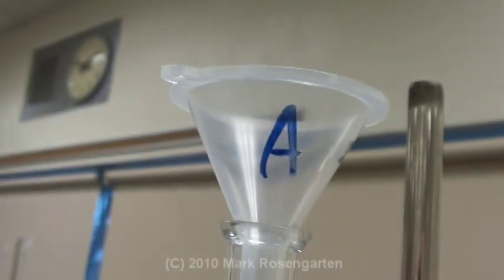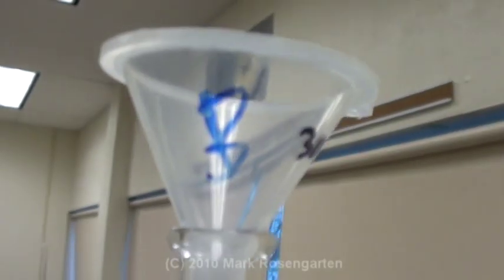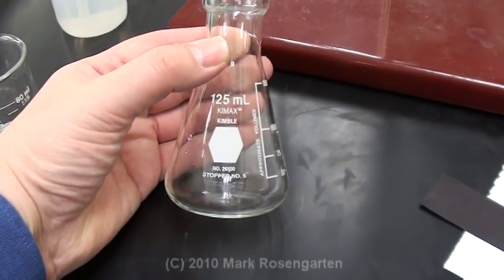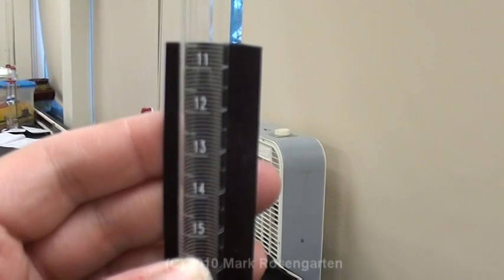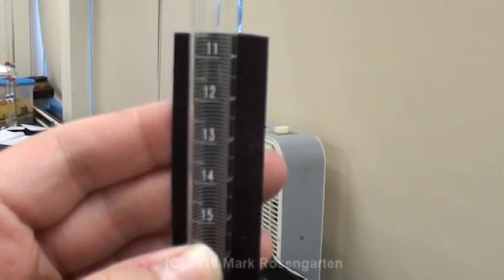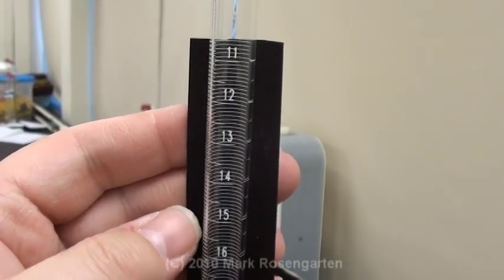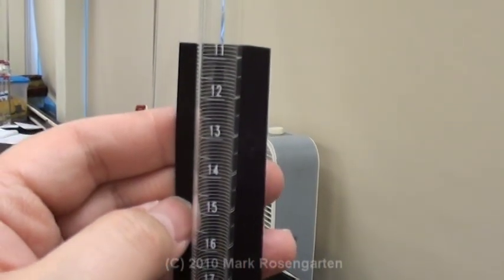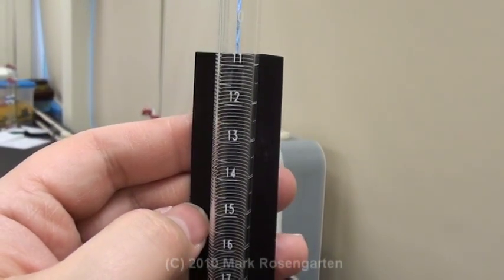Two funnels, one labeled A for acid, the other labeled B for base. A 125 milliliter Erlenmeyer flask, a white piece of paper to improve contrast when you put it on the ring stand, and a black piece of paper to help improve contrast when you read the numbers off the burette. Without the black piece of paper. With the black piece of paper. Look at that incredible difference.